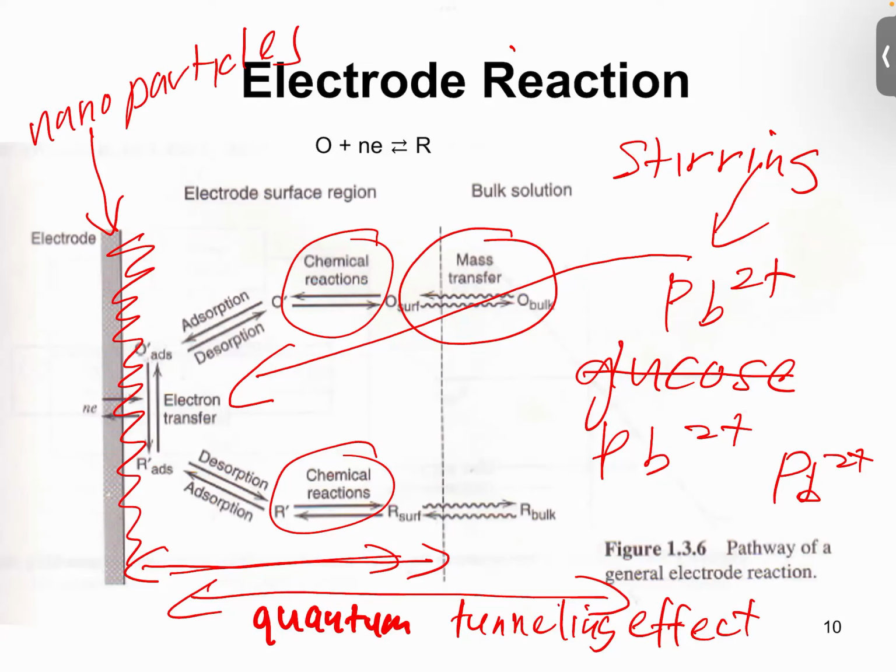Because there are, of course, theories saying that nanoparticles, metal nanoparticles, can electrocatalyze. Means that it helps the electron move faster, okay, move faster to the surface of the electrode, right? So this one we do. And also, if you remember, this is where we put all the biomarkers. The DNA, the antibody. So this is where we put the biomarkers.